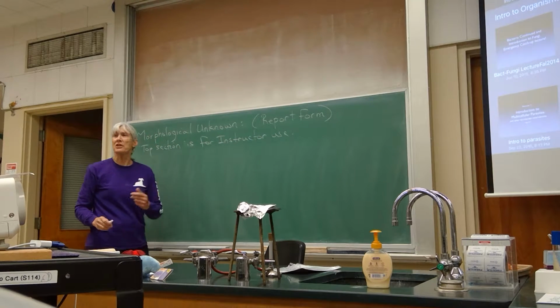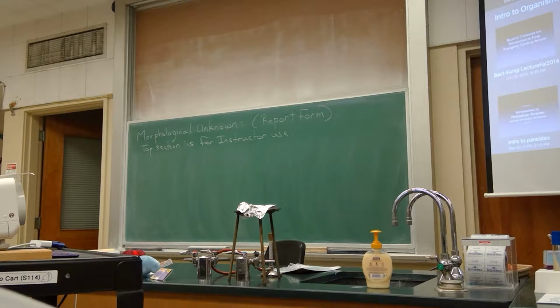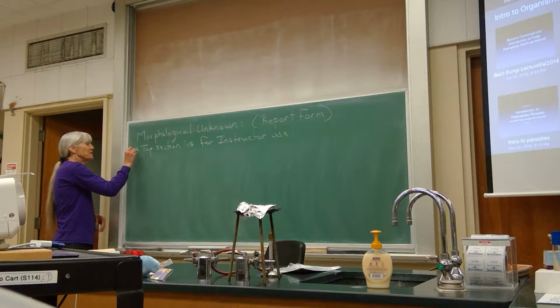Questions like, is the culture pure? Are the colonies well isolated? Is it correctly labeled? I'm going to grade that. Don't fill it in. But if you want to fill it in, go ahead. But I'll write over it because I'm going to grade that. So that's that little top section.